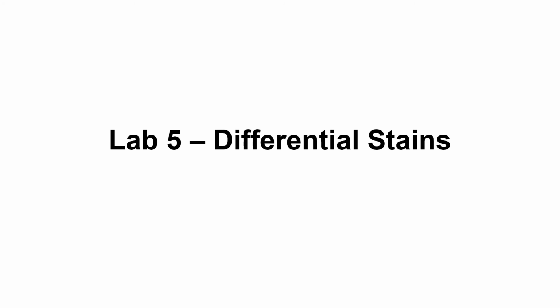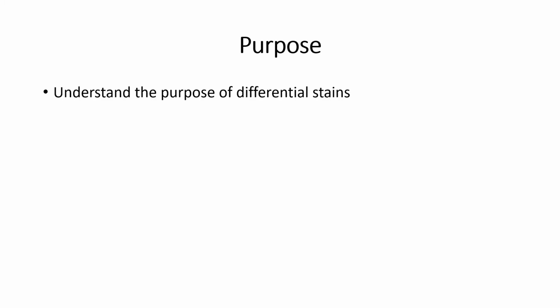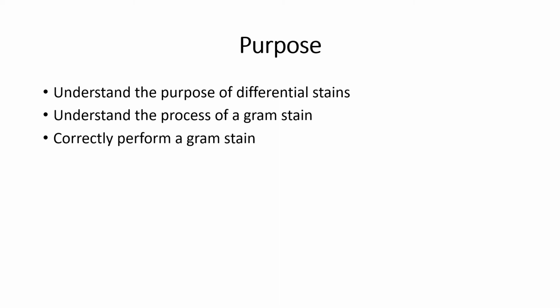This is the lecture for Lab 5, Differential Stains. The purpose of this lab is first to understand the purpose of differential stains, second to understand the process of a gram stain and the reagents used, and lastly to correctly perform a gram stain.